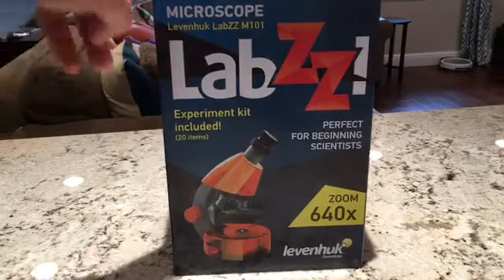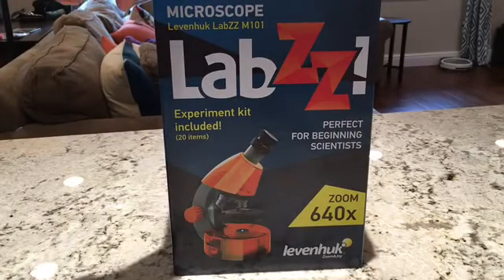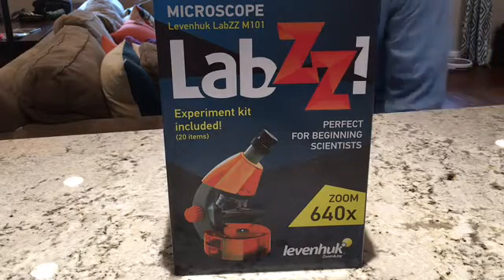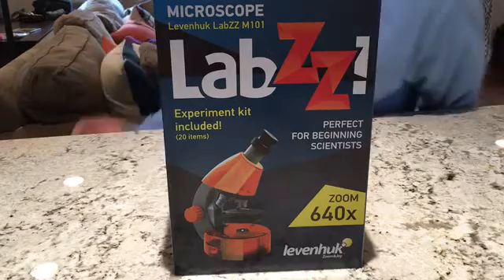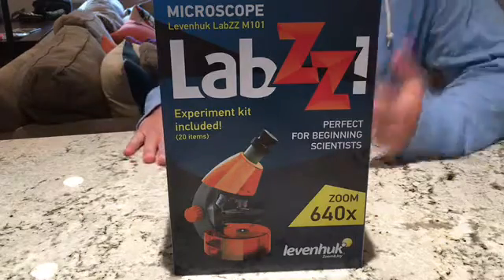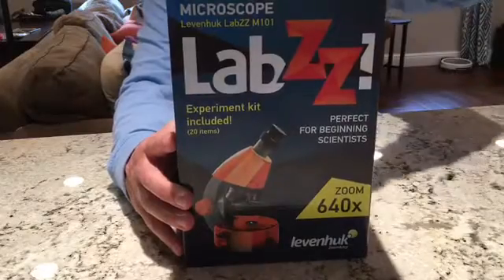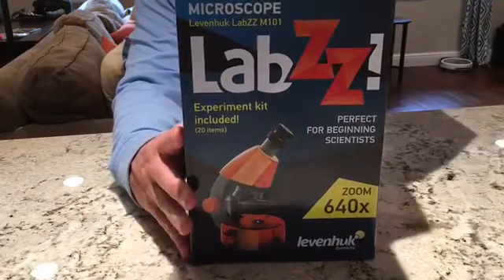Quick unboxing and video review of my Levenhuck Labs Beginner Microscope. School for my kids lets out in three days and we're trying to figure out some things to do over the summer. I enjoy science and all that good stuff — I'm a nurse — and growing up through high school, these were things that I loved and sort of want to share with them.